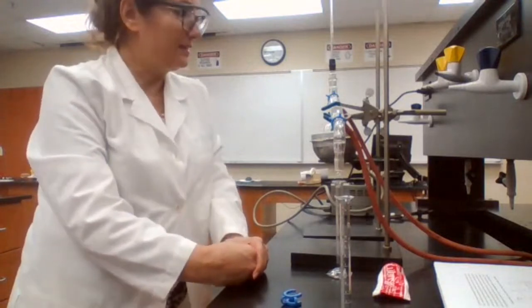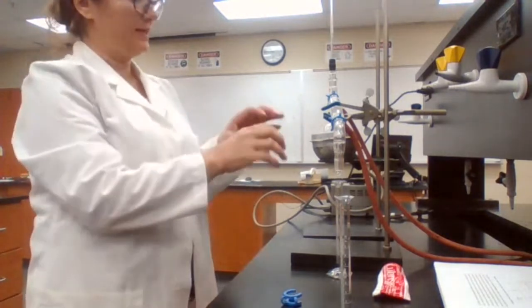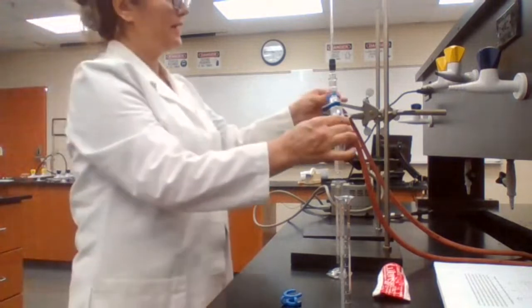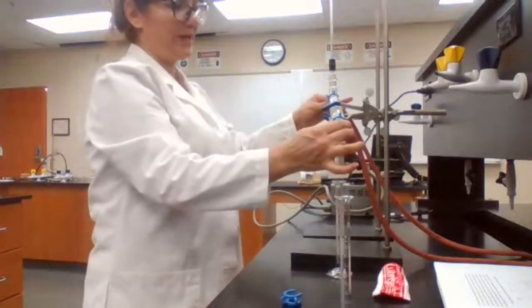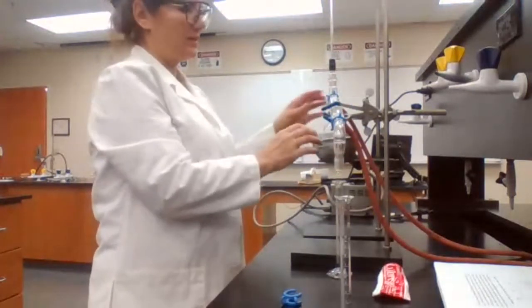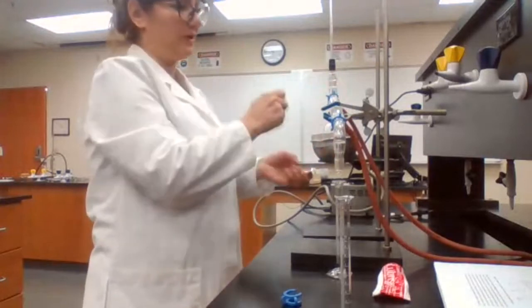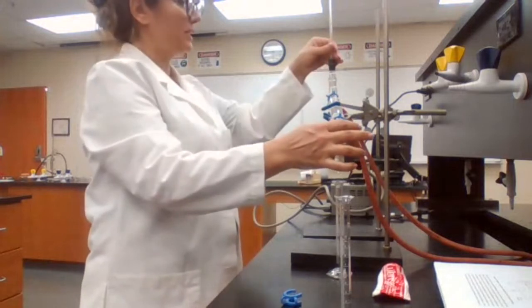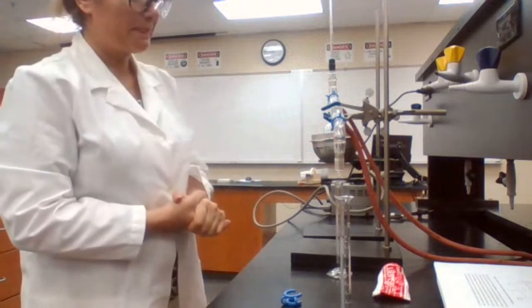Okay, your answer for the first question is greasing. One purpose is to create seals in the system, so the vapor does not escape from the openings. After you're done and you add your sample, you want to make sure that your setup is all put together properly. There is no gap, because sometimes by moving one piece, the other one is going to move. So you double check it before you turn on the heat, or before the sample starts boiling.